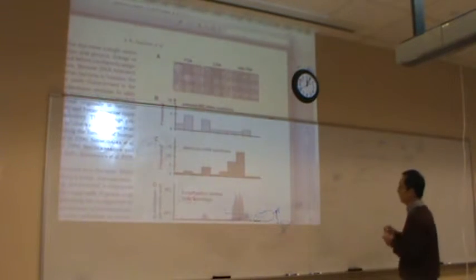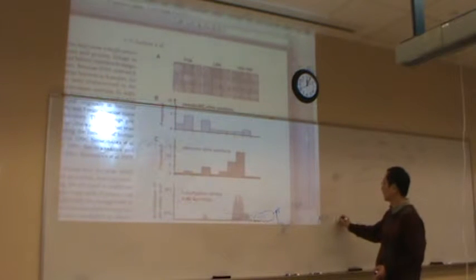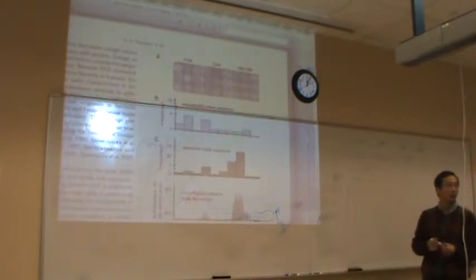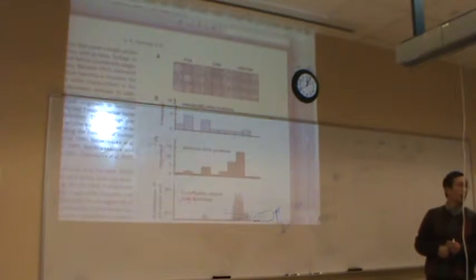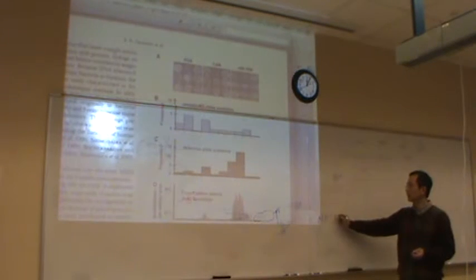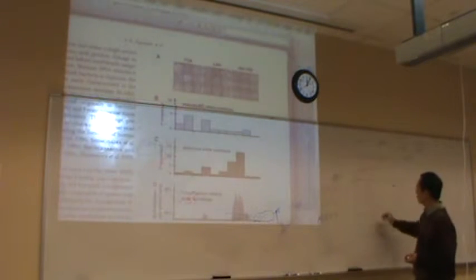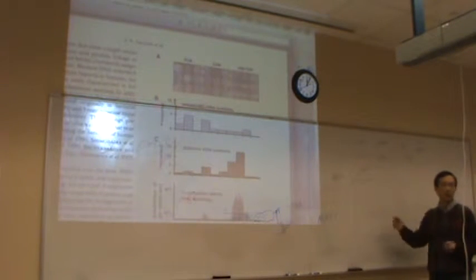So in any case, we need the mutant. I'm going to just write one. There is one mutation, M707I, so that's one mutant. D621N. That sounds correct, yeah. So each group has their own mutation too, right? I'll just use one example here. And then on the plate, we're going to divide it into a grid.